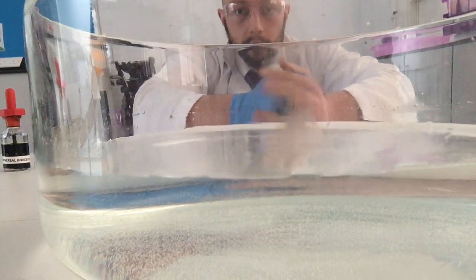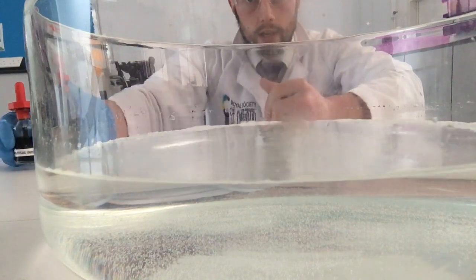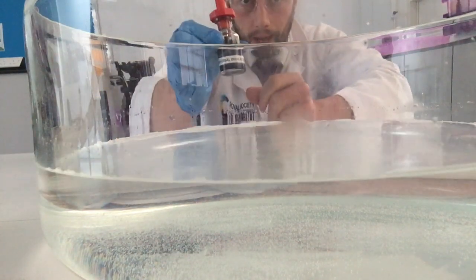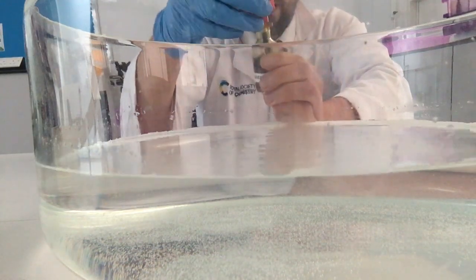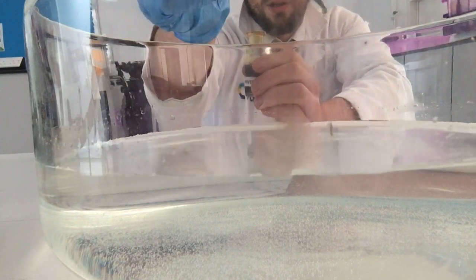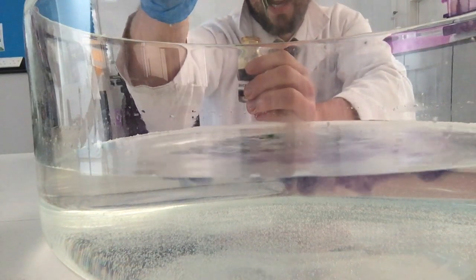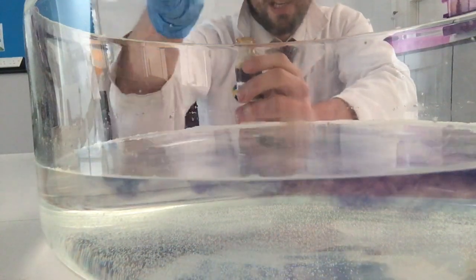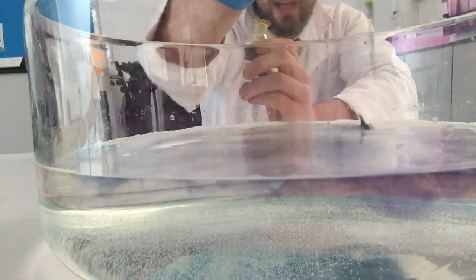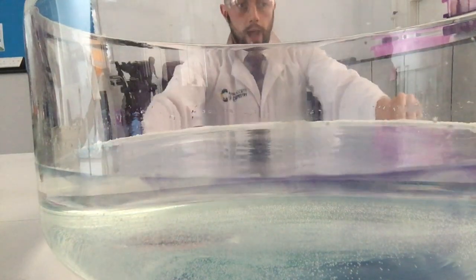Now we know that lithium hydroxide, sodium hydroxide and potassium hydroxide are all alkalis. So they should go purple when I add some universal indicator. Let's check that last little thing to see if I've produced alkalis. There we go. I hope you can see where my indicator is added in. We've got a purple colour. The green universal indicator is going purple in my now alkali solution. And that is chemical properties of alkali metals.